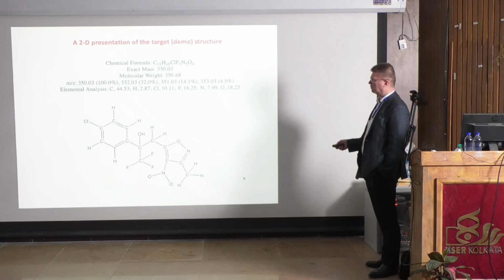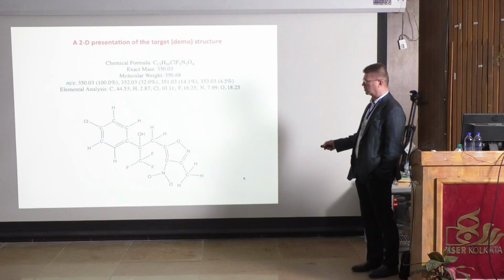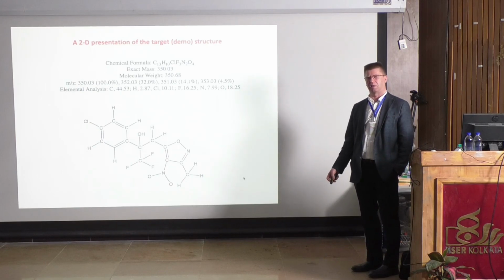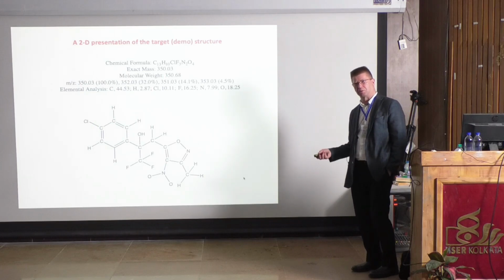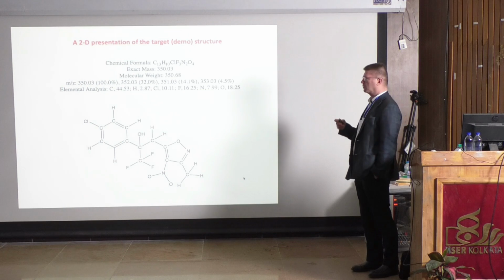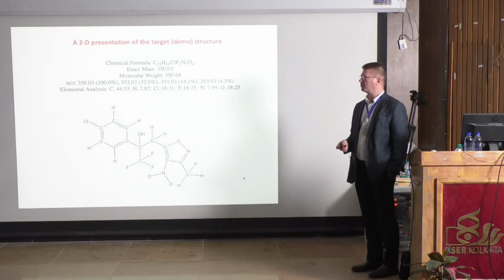You can see from this sp3 carbon, there are 4 different substituents. So this is the chiral carbon. So we have here R or S. And now our idea is to look into this. We got the data, and the data seems fine, so we start the business.